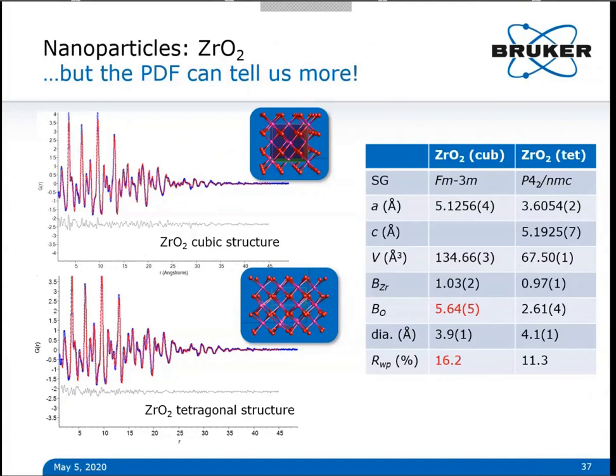We also had a question, Michael, on the single crystal diffractometer. One of the questions was how the sample is loaded. So how do you prepare the sample when you want to measure it on a single crystal machine? And how did you measure the background there? Actually, the way we did it for this example was simply to take the capillary as is, the same goniometer head that's used on the powder instrument, and mount it on the stage for the single crystal instrument.